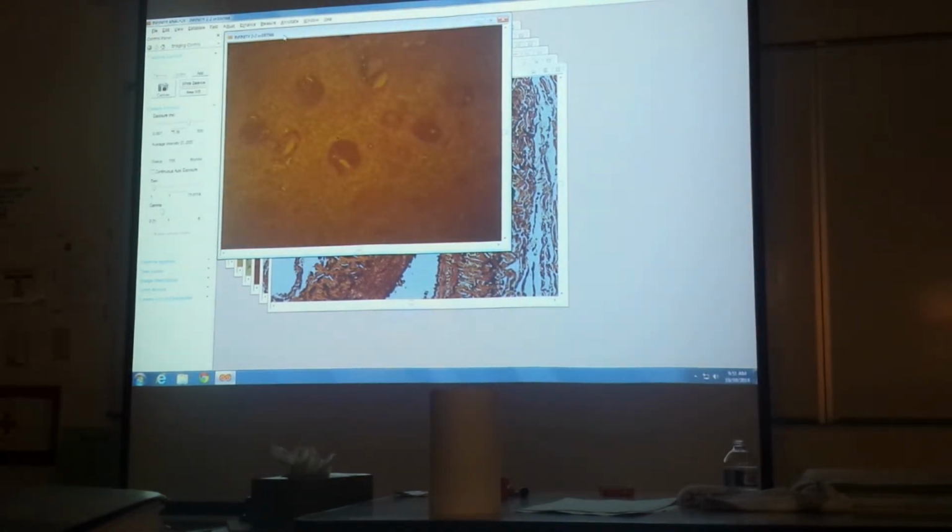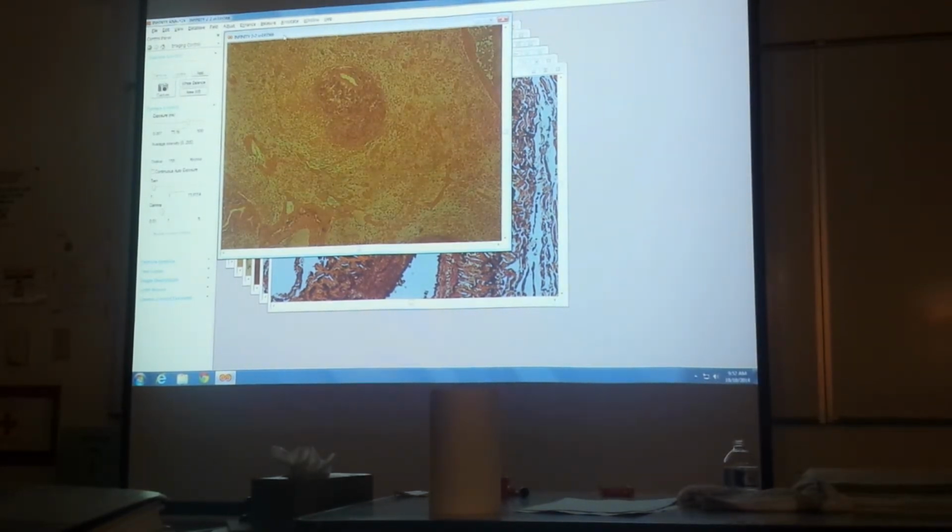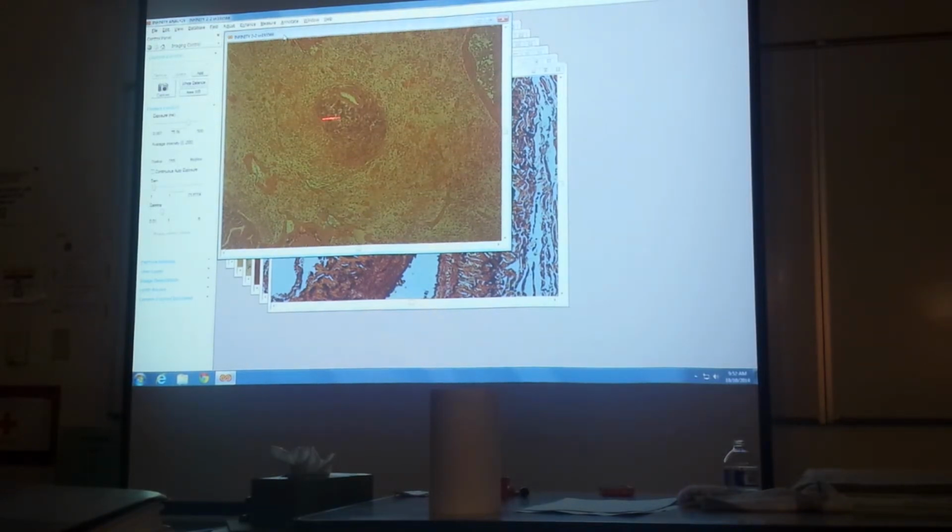Here's a low mag. What I would do is scan around and look for the white pulp, a purple splotch. It's called white pulp and it's purple. Boom, boom, boom. All right there. Because those have little arterioles in them. If you go closer up, I choose you. We're looking good. And any of those are pretty good. The white pulp with the central artery or arteriole.